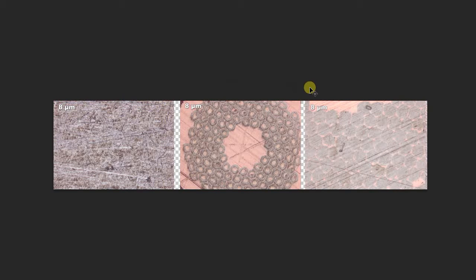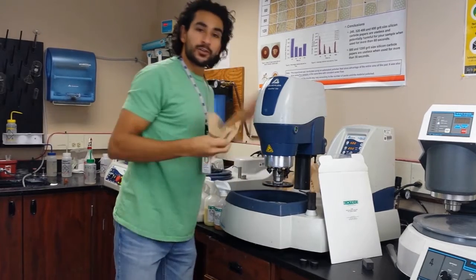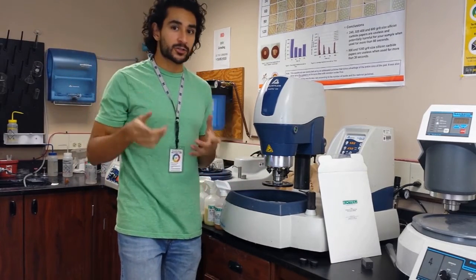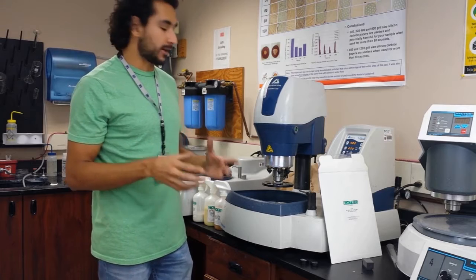One thing to remember about this step is that the main reason I want to do it is because it gets rid of the silicon carbide particles, which should be all gone by now. Remember, I'm moving to a new grit size, so I've cleaned everything properly and put it all back where I found it. Make sure you do that every time you use anything in this laboratory. Put it back where you found it and leave it as you found it. Let's move to the next type of pads.